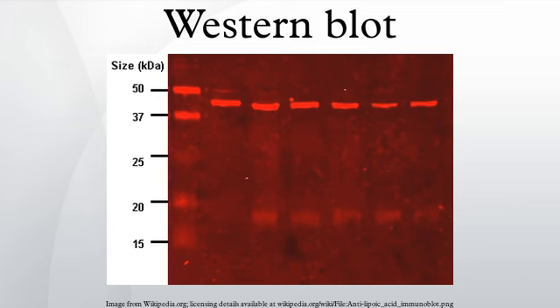By far the most common type of gel electrophoresis employs polyacrylamide gels and buffers loaded with sodium dodecyl sulfate. SDS-PAGE maintains polypeptides in a denatured state once they have been treated with strong reducing agents to remove secondary and tertiary structure, and thus allows separation of proteins by their molecular weight. Sample proteins become covered in the negatively charged SDS and move to the positively charged electrode through the acrylamide mesh of the gel. Smaller proteins migrate faster through this mesh and the proteins are thus separated according to size.